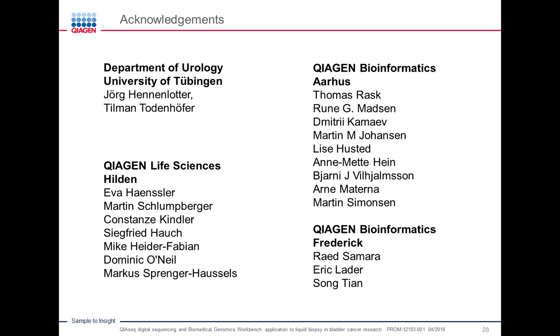Our first question is, how do I access the QIAseq panel plugin? So this is very easy because when you open up the Biomedical Genomics Workbench, you will have a plugin button on the top right corner of the desktop application. And there you can see which plugins you have activated or the ones that you can download. So it's sufficient to click download on this plugin to install it and have it ready with all the workflows available on your left-hand side as soon as it is installed.